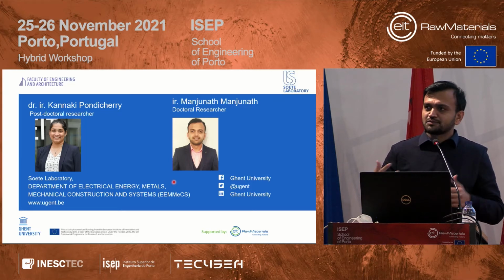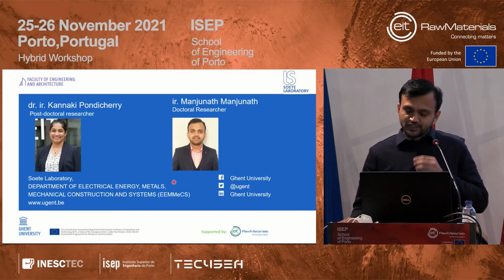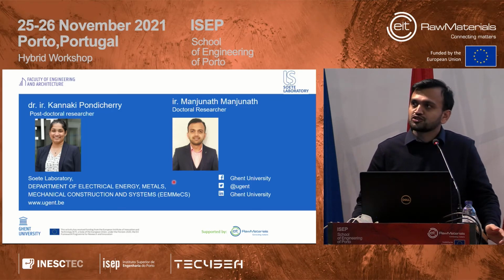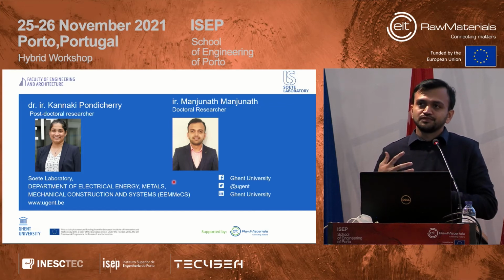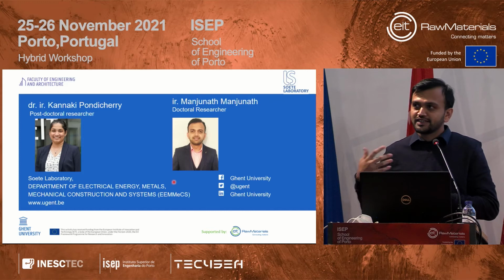To conclude this overall presentation, currently we selected a material based on tribo-corrosion results, and we're continuously interacting with the team to make a robust housing for the instrumentation model and for the laser head model.